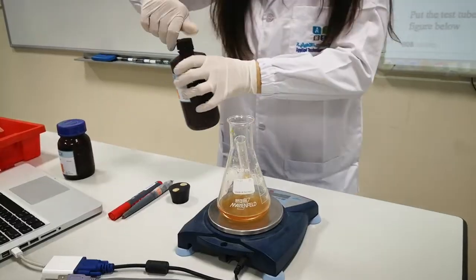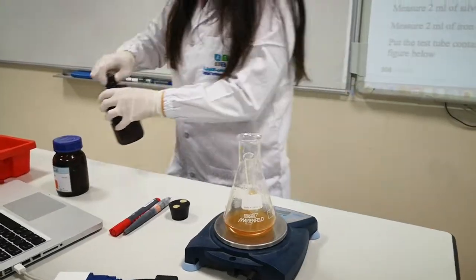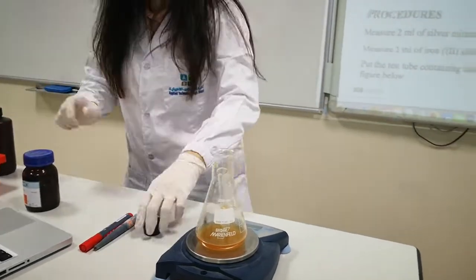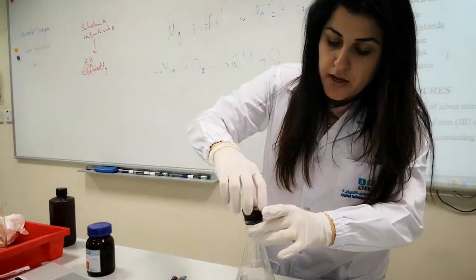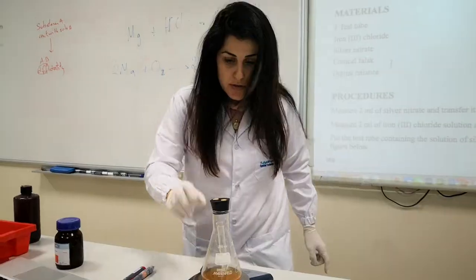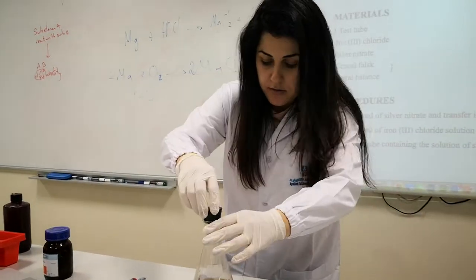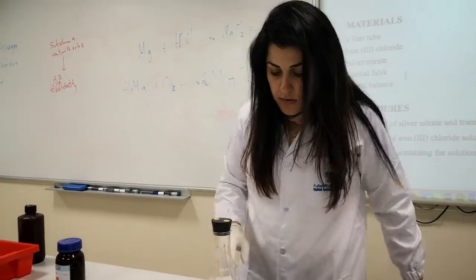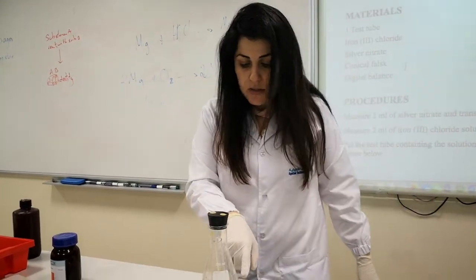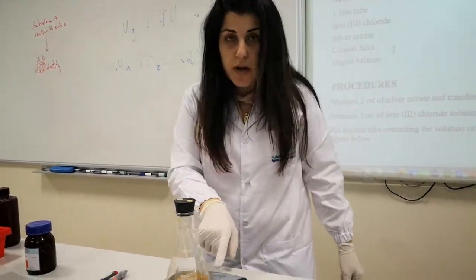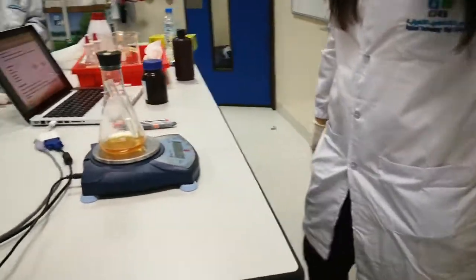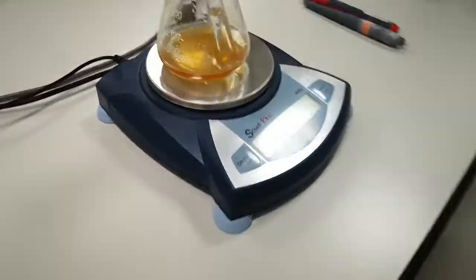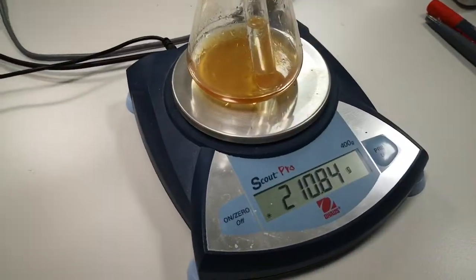The reactants have not mixed yet. We're going to close the system and measure the mass. The mass is now 210.84 grams.